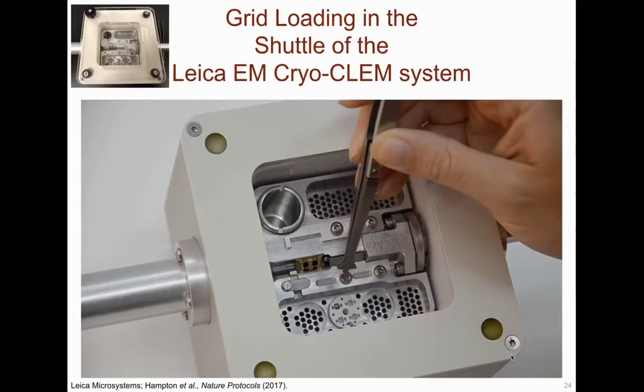As with all steps in cryo-EM workflows, the most sensitive steps are those that include sample handling by us, i.e. by human hands. This is the reason many systems for cryo-sample processing to cryo-imaging have automated sequences, multi-specimen options, and robotic elements.